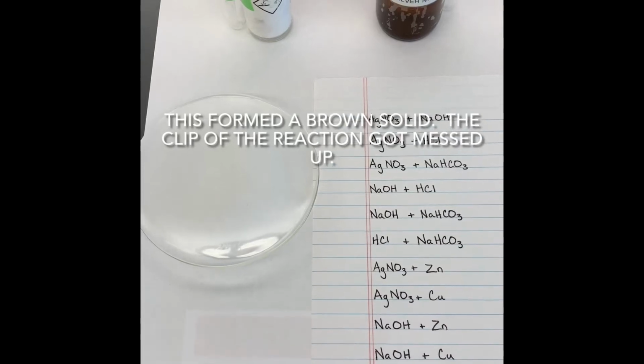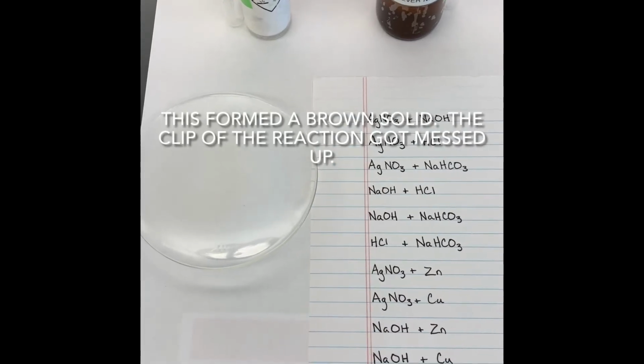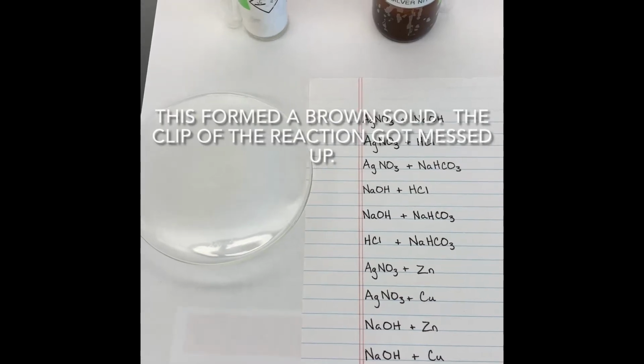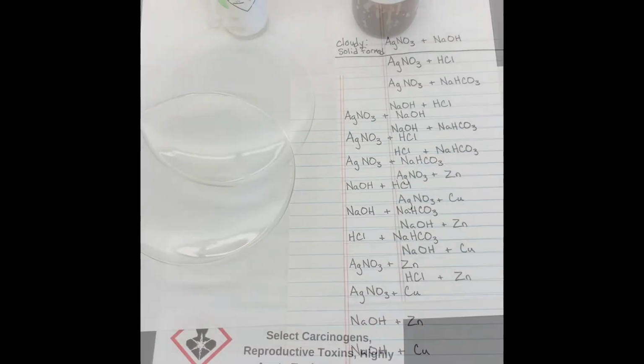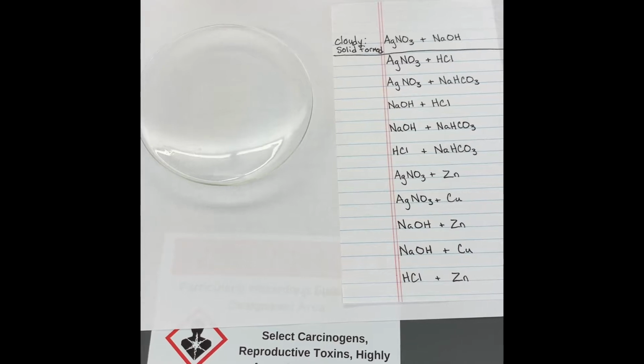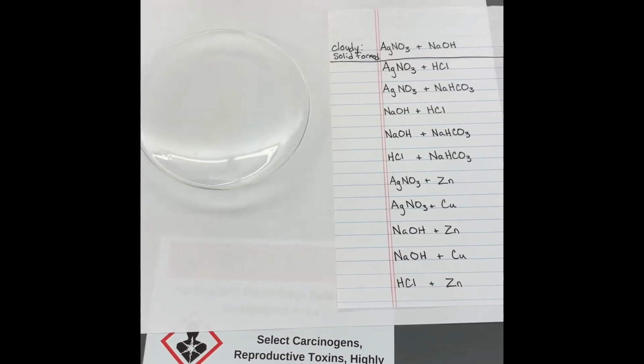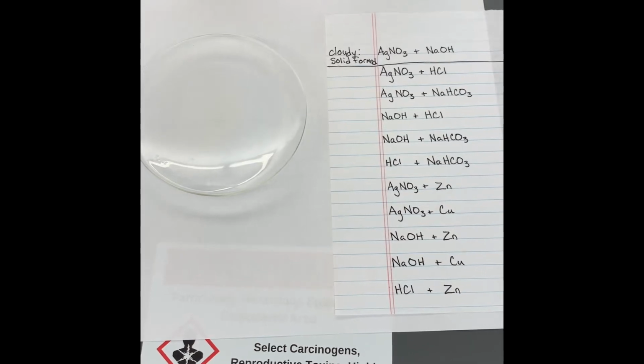For our first reaction, we have sodium hydroxide, NaOH, and silver nitrate, AgNO3. Here we'll mix silver nitrate, AgNO3, with HCl, hydrochloric acid.